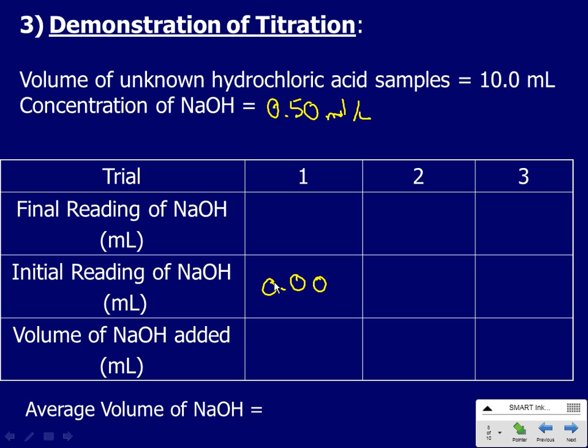Okay, so now we're ready to titrate. I'm going to bring this up a little bit. Students like one person to run the tap, and then the other one swirls. In a university lab, you're working alone, so this is the way it looks when you're working alone. Swirling and adding. And because I know it's going to be about 10 mils, I don't need to get too excited. Can we see the purple?